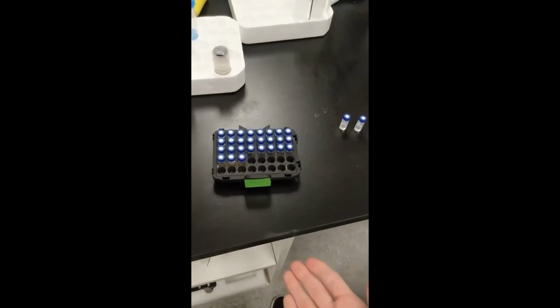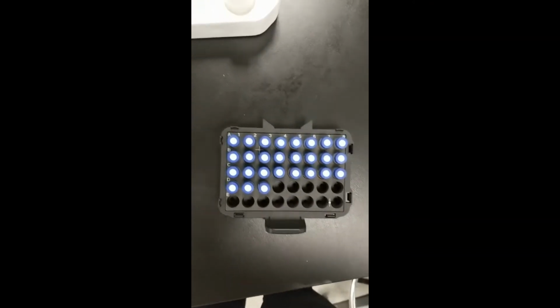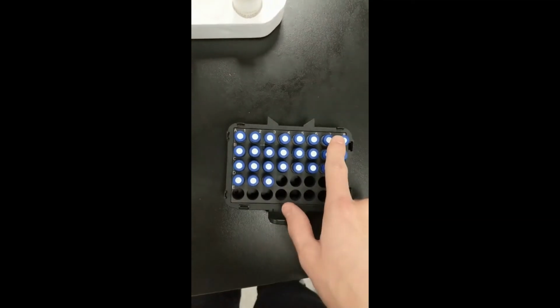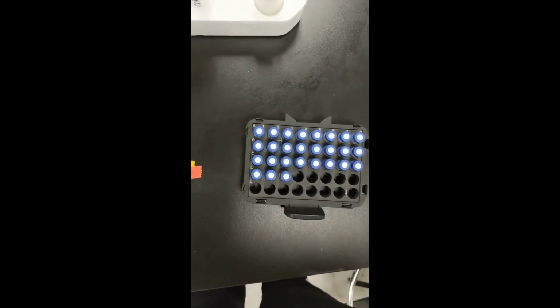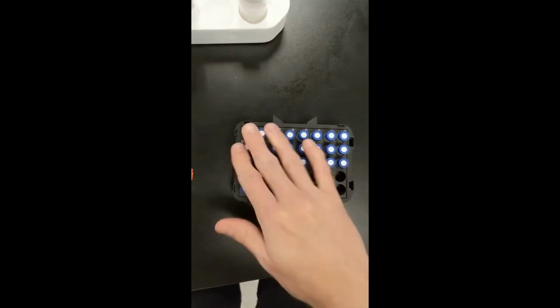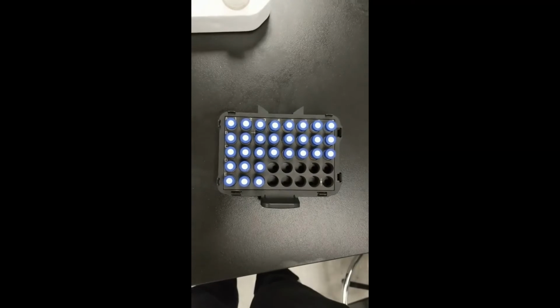Alright, I've got my tray out and I've got my 3 samples that I want to run. Let's take a look at this tray. You can see that there are the letters A through E and 1 through 8 right here. I'm going to put my samples in these 3 spots down here at the bottom. These are someone else's samples. You don't usually want to touch other people's samples unless they're done running and you know that it's okay to toss them out.